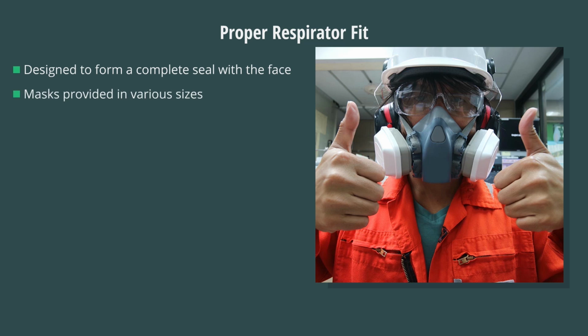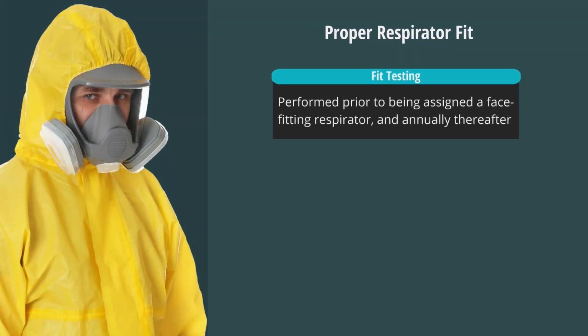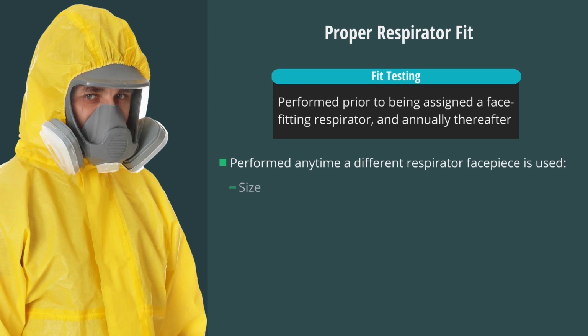Manufacturers provide masks in various sizes, allowing a proper fit for most individuals. Fit testing is the procedure that is performed prior to being assigned a face-fitting respirator and annually thereafter. Fit testing must be performed anytime a different respirator facepiece is used, such as size, style, model, or make.